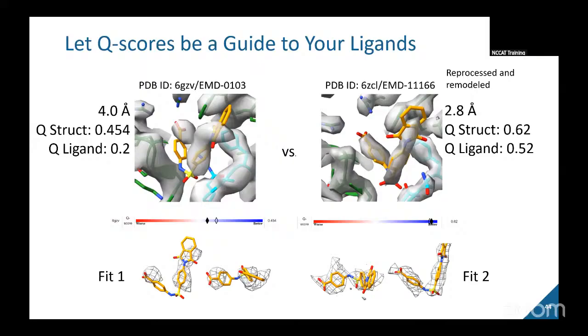You can see, by the way, the slider shows up pretty well because we were always kind of conservative with, of course, like we heard, there's no single resolution. We're conservative in how we report. We did have features in there that really made it look more or less okay. I mean, it's definitely not like the newer one. But yes, the density's pretty crummy on the left of the ligand in the first place.